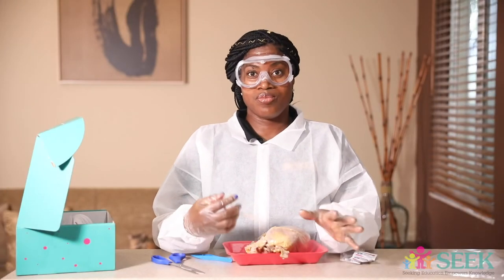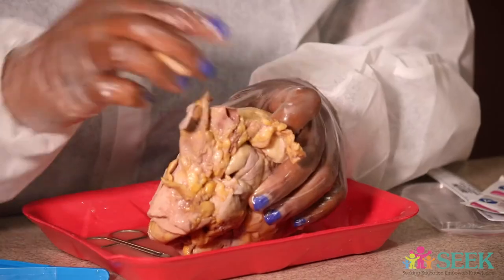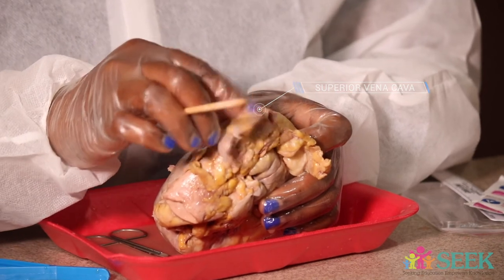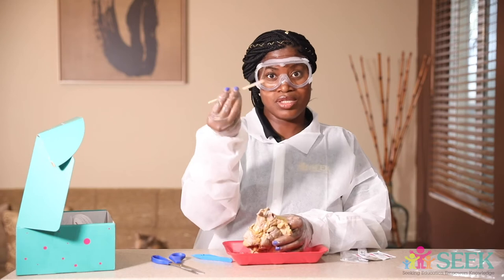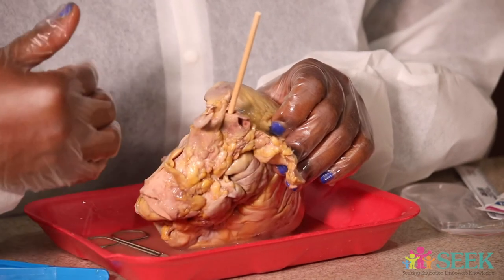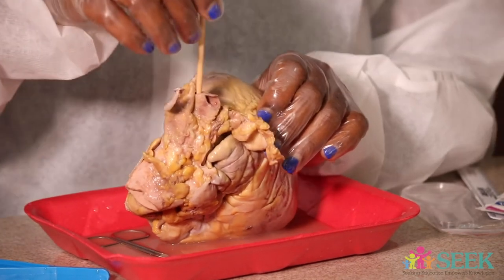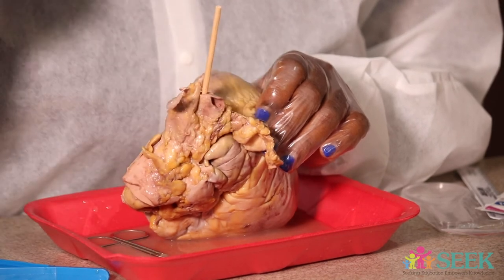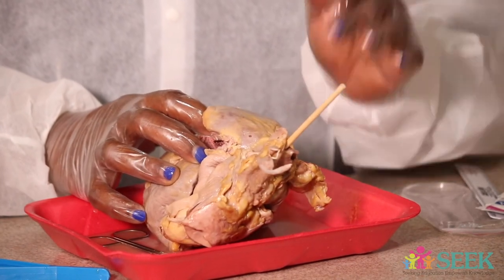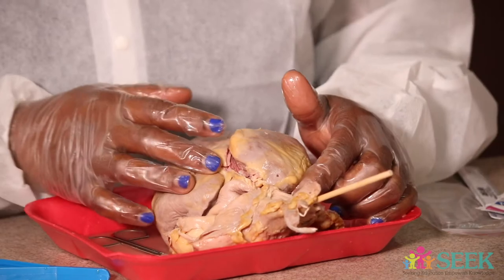Now that we are back, hopefully you explored a little bit just to get familiar with some of the different parts. Remember I was talking about these two little holes — we have this one to our right, by the right atrium. This is the superior vena cava; this allows the blood to flow into the atrium. I'm going to poke it with this wooden stick that comes in your kit. This is how the blood enters the heart — through the superior vena cava and also the inferior vena cava. Then it goes to the right atrium, which is what I showed you earlier.